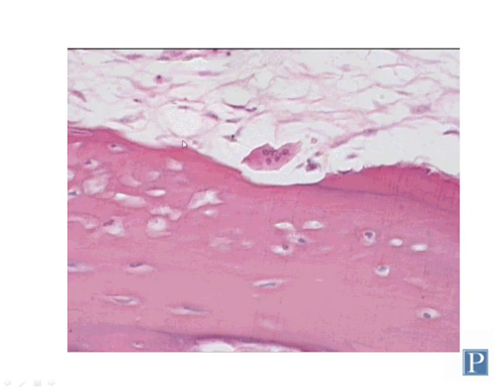Like osteoblasts, they lie on top of the surface of the trabeculae, but they are much larger than osteoblasts. The shape of the cells is more irregular, and they are usually multinucleated, and they may have several or even dozens of nuclei. In this particular cell, you can see at least 1, 2, 3, 4 or 5 different nuclei in this one cell.